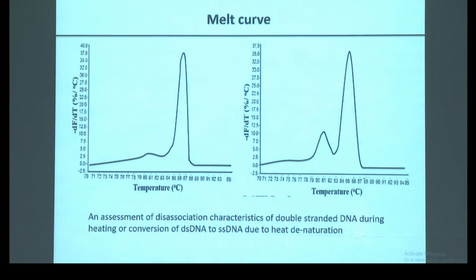When you perform a qPCR using SYBR Green chemistry, we have talked that it is not specific. To check whether it is specific or not, we perform a melt curve analysis after finishing the qPCR. What happens when you gradually raise the block temperature from 70 degrees to 95 degrees, there will be some point where all the PCR product will break and get separated.